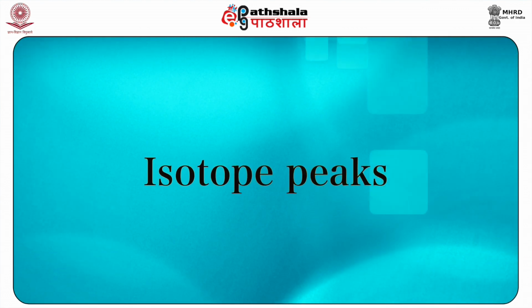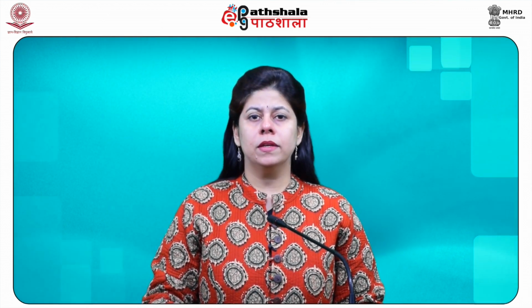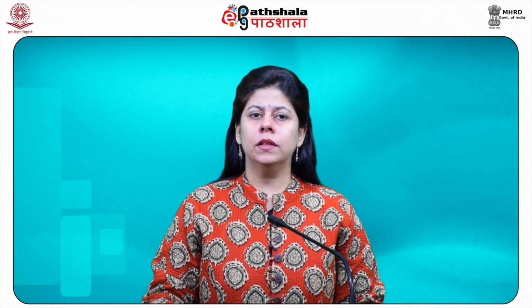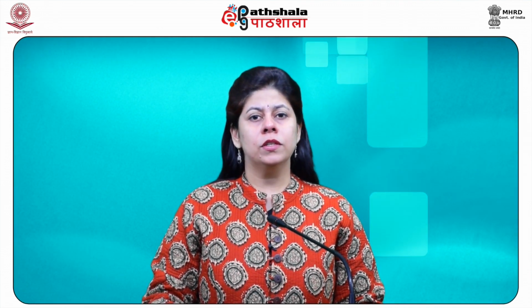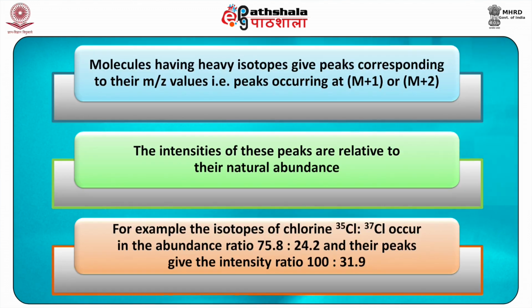Isotopic peaks. Many elements have more than one naturally occurring stable isotope, which produce peaks in the mass spectrum other than the main peak, the one due to the most abundant isotope. Molecules having heavier isotopes give peaks corresponding to their m/z values, that is, peaks occurring at M+1 or M+2. The intensity of these peaks is relative to their natural abundance.